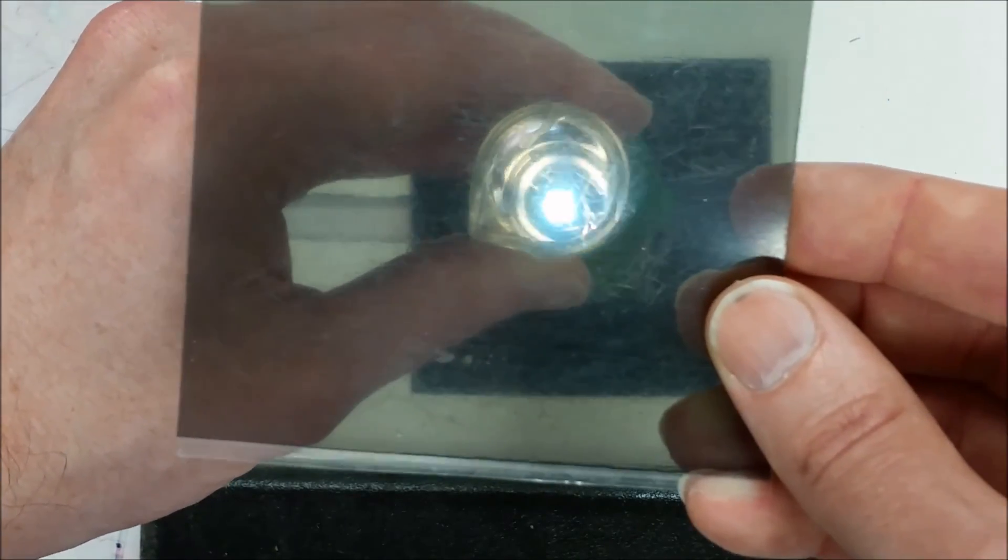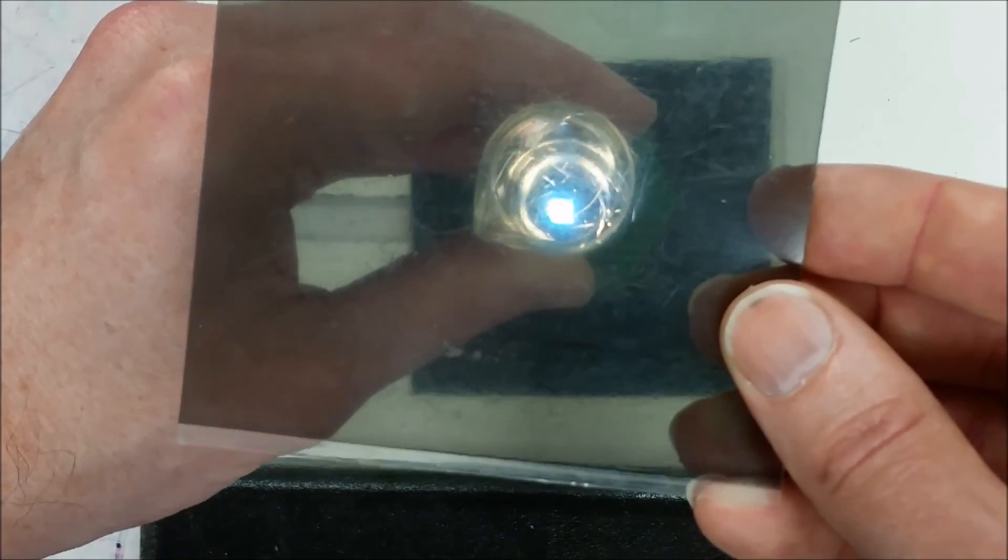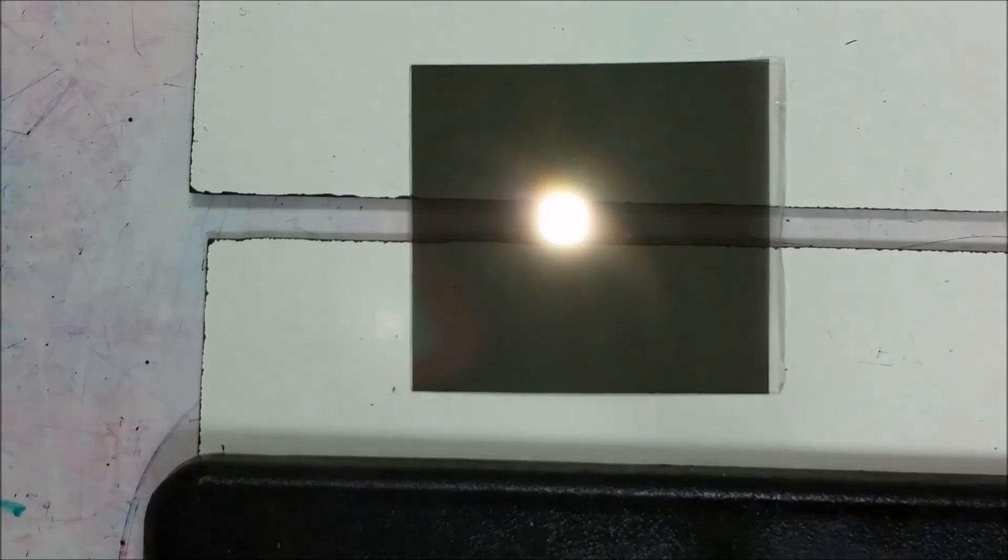And so that's how a polarimeter works, is it's able to measure the amount of an optically active solution by how much the plane of polarization needs to change to get to a minimum, back to a minimum, between the two polarizing filters, compared to when there's no sample present.